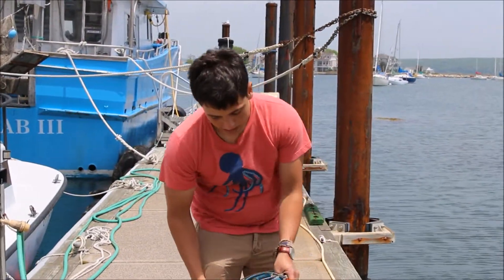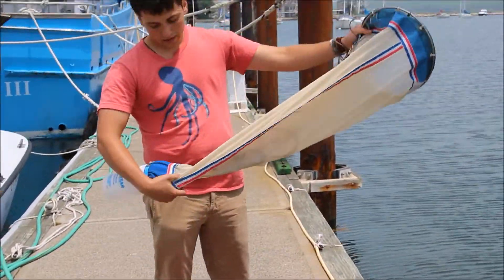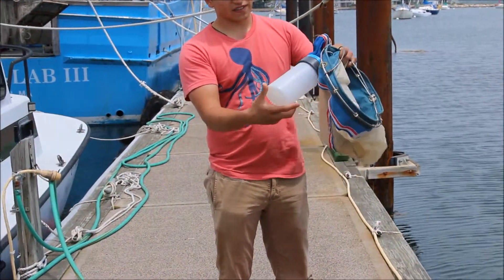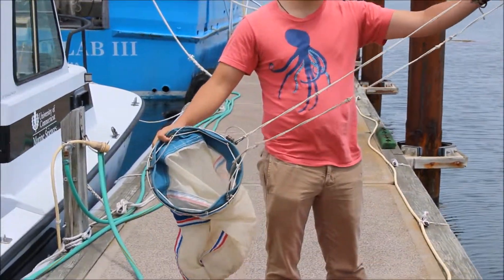So with us we have our bucket with the plankton net in it and a collection jar on the end. The plankton net is on a rope so we can drag it along with us as we walk down the dock.